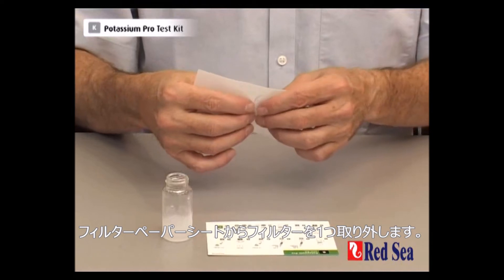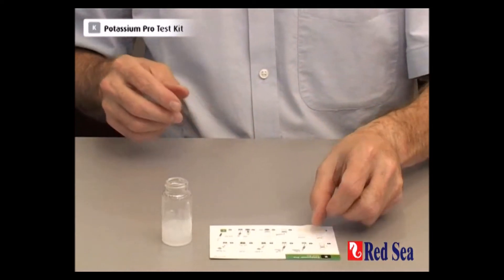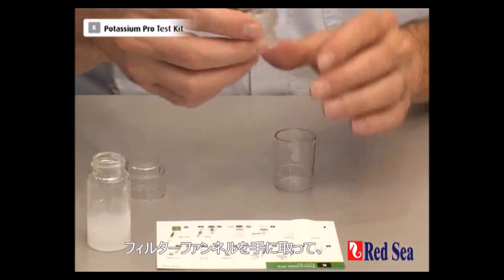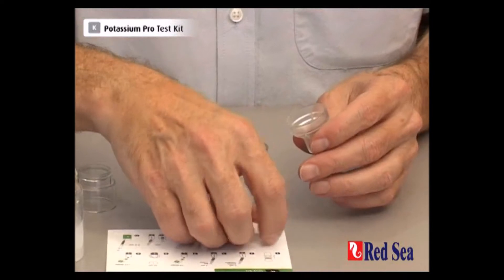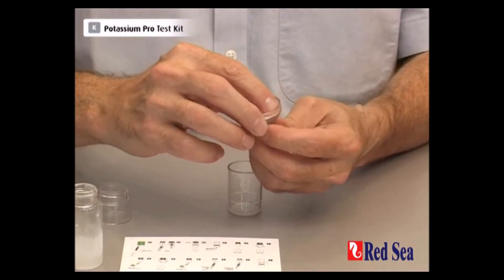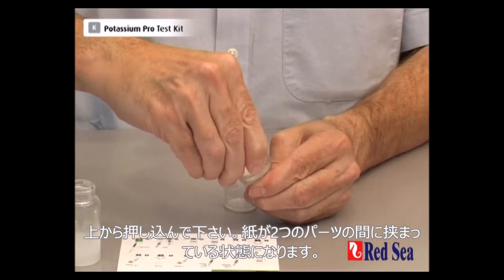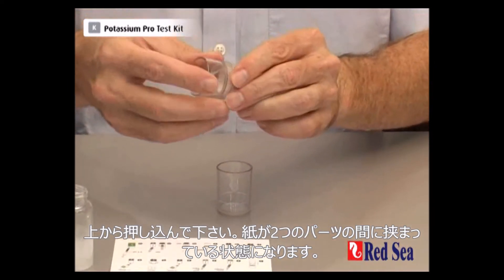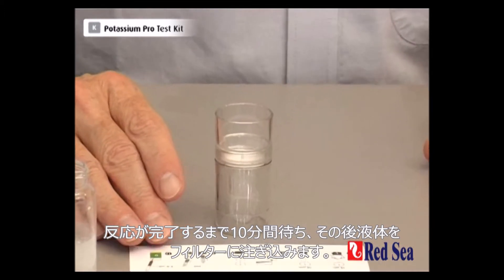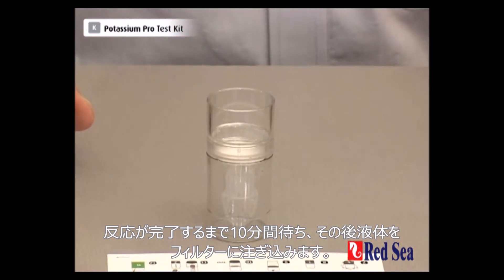Carefully remove one of the filter papers from the filter paper sheet. Now we're going to place it into the filter unit — take the filter funnel, gently place our filter paper above, and push the top into position. That traps the paper between the two parts and we place the assembled filter on top of the filter cup. We now wait for the rest of our 10 minutes for the reaction to finish and then we're going to pour it into the filter cup itself.